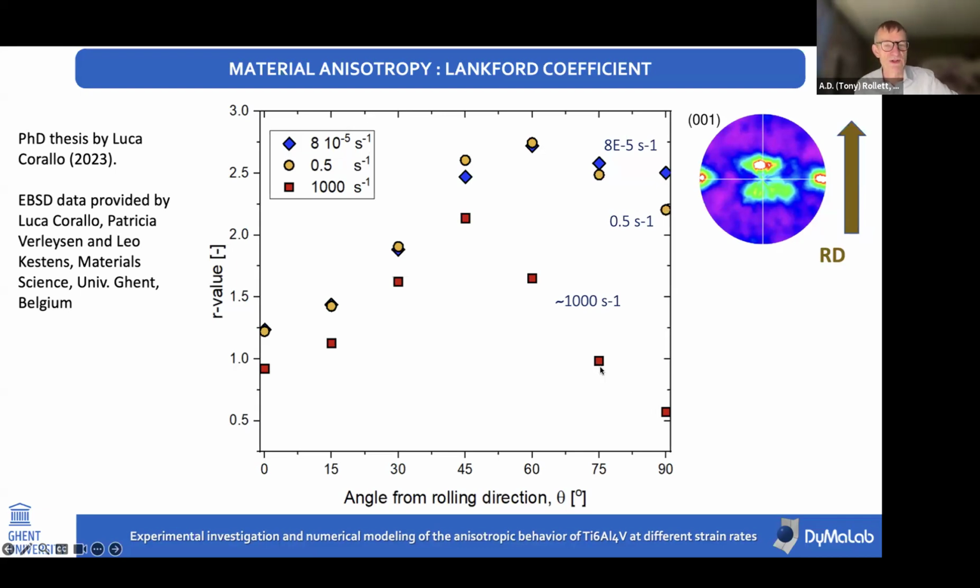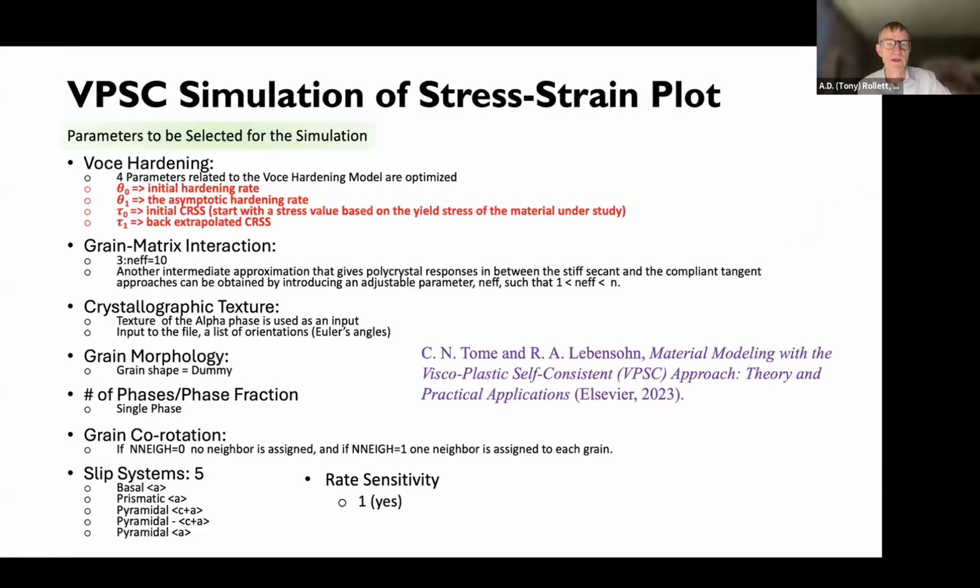So the challenge was, could we model this? So again, thanks to Luca and his colleagues for the EBSD data. So we used a very standard model, viscoplastic self-consistent.